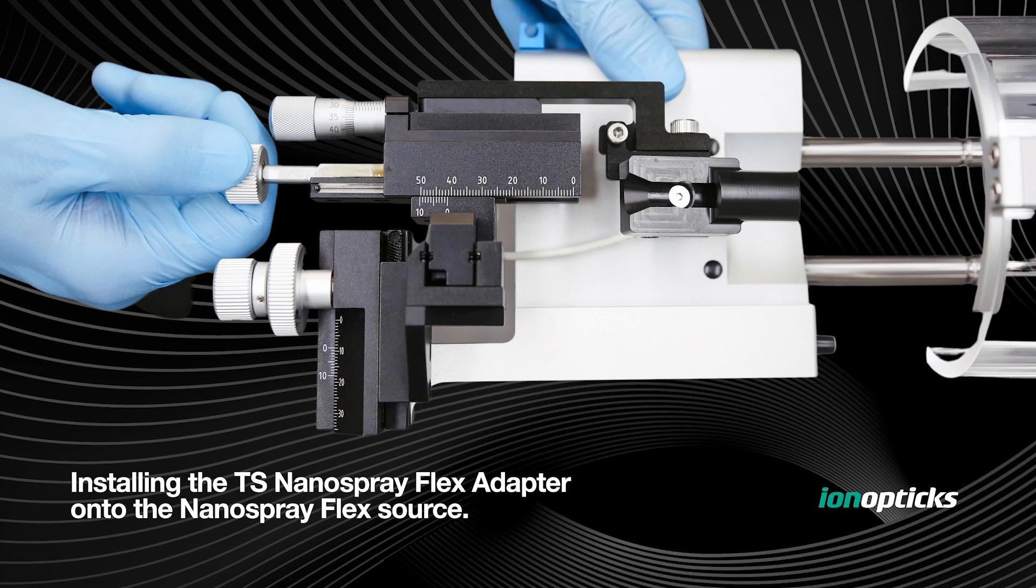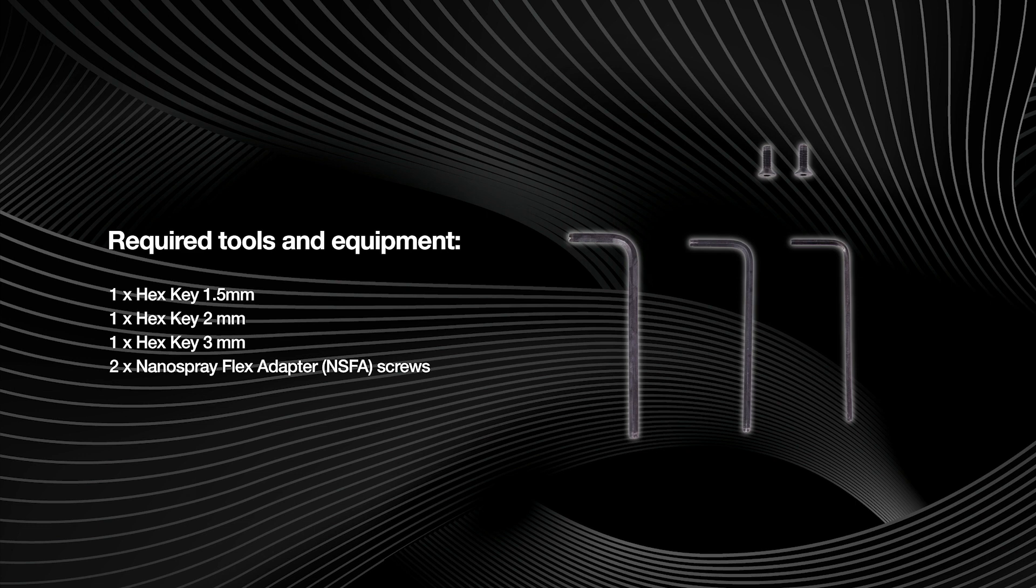This video demonstrates how to install the TS Nanospray Flex Adapter onto the Nanospray Flex Source. Listed here are the tools and equipment required to install the Nanospray Flex Adapter.